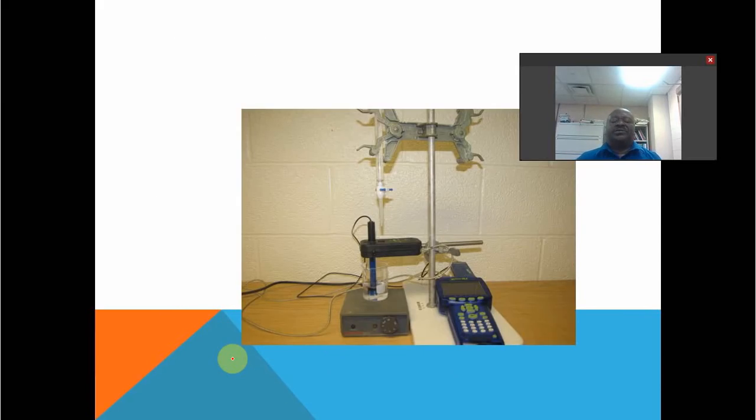All right, so there's our titration setup. So the famous data logger, a pH, right? And then the burette there, and this here is a drop counter. So of course you'll calibrate the pH in the normal way that you did last week. And then you'll also calibrate the drop counter.